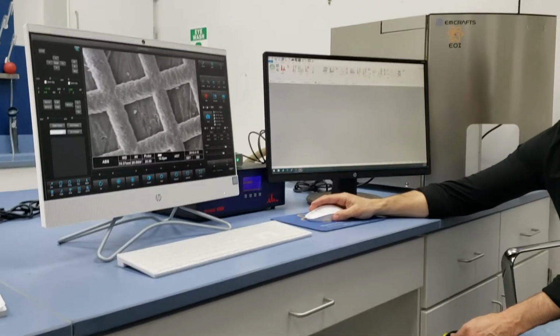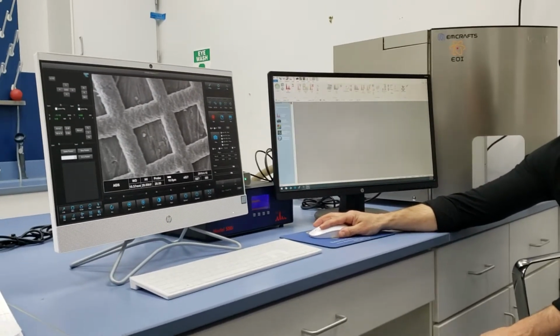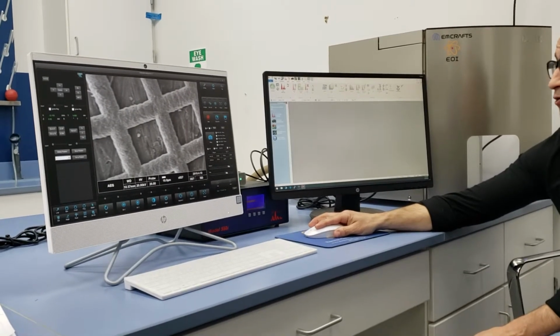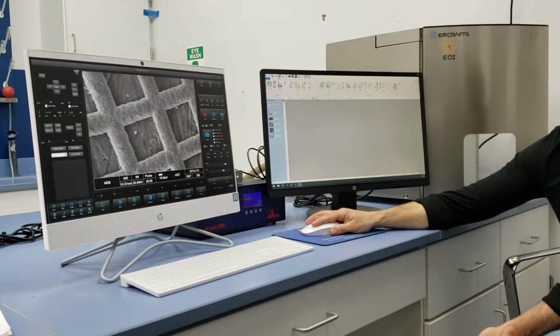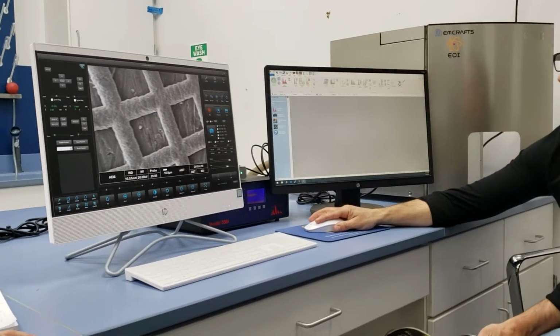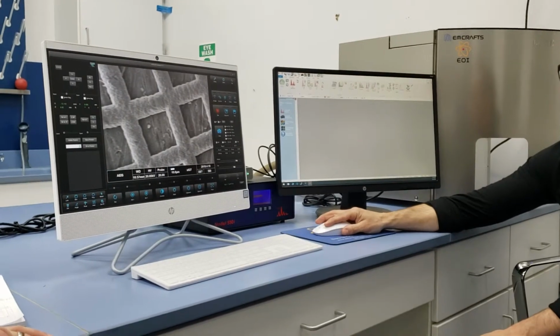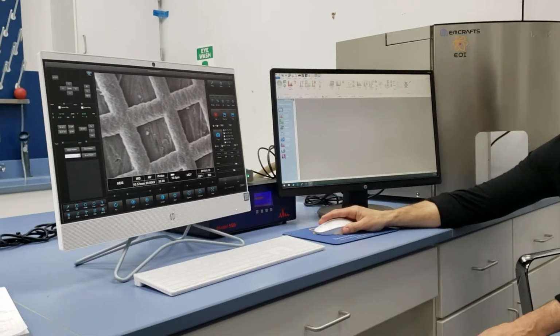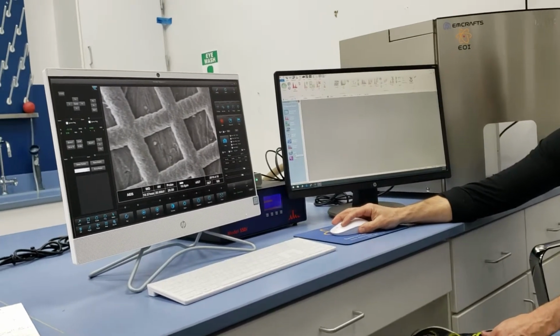Get rid of the interactive help, it's history. The life preserver gives you your interactive help window back. So just like you need a life preserver, this is a very quick reference guide to help new operators run the software bundle. Right? So it asks you, what would you like to do? I would like to work with Spectra. And that's going to flow chart me all the way down to export my data out of the grid.